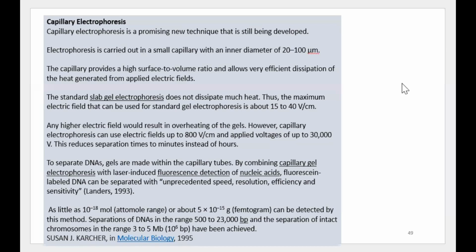So let's discuss capillary electrophoresis, right? I'm sharing my screen here, the PPT. Now, when it comes to capillary electrophoresis, as the name suggests, you are using capillaries. When we say electrophoresis, what comes to your mind is the electrophoretic unit, either horizontal or vertical.